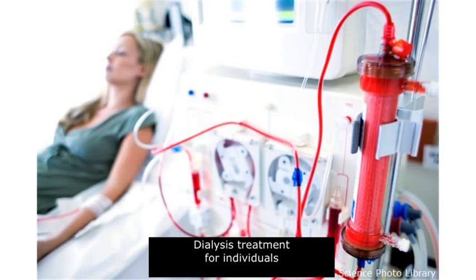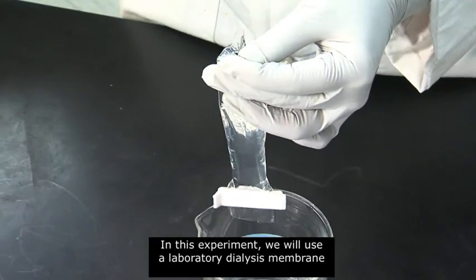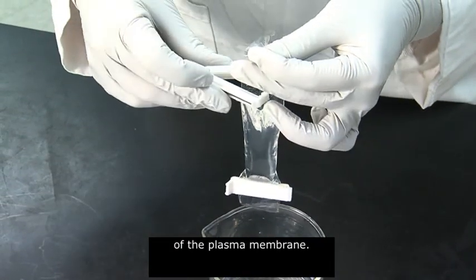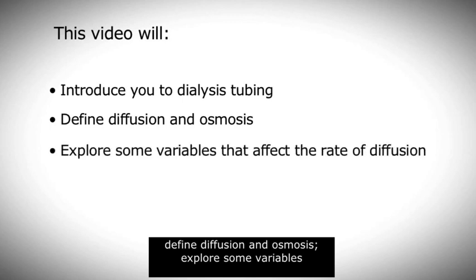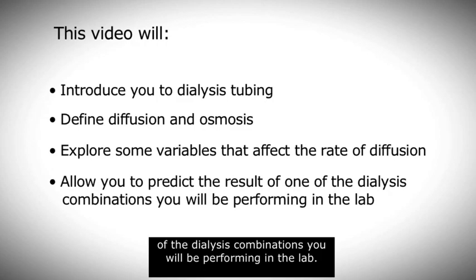Dialysis treatment for individuals with chronic kidney disease relies on the diffusion of solutes through a semi-permeable membrane. In this experiment, we'll use a laboratory dialysis membrane to illustrate the selective permeability of the plasma membrane. This video will introduce you to dialysis tubing, define diffusion and osmosis, explore some variables that affect the rate of diffusion, and allow you to predict the result of one of the dialysis combinations you'll be performing in the lab.